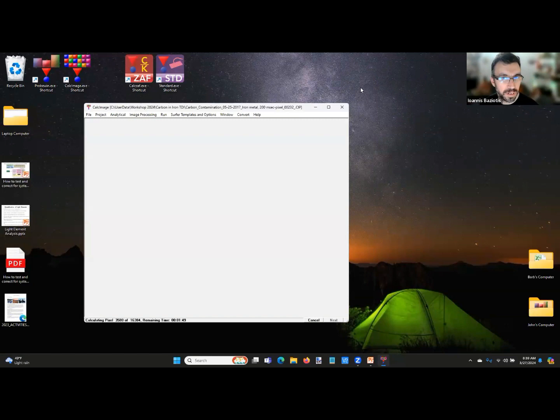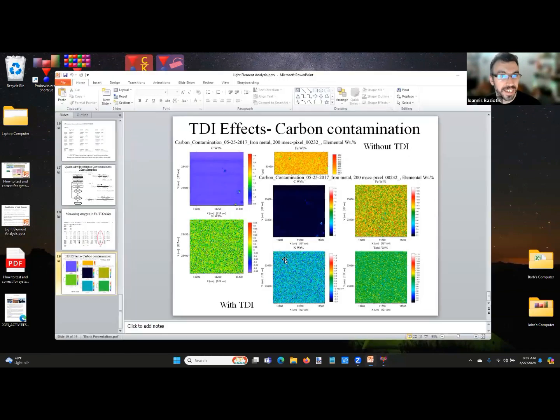Okay, so you have finished, I guess, so we can switch to the questions and the discussion session as well. So one question is, how is the aggregate intensity calculated? Is it an average of concentration from each spectrometer?